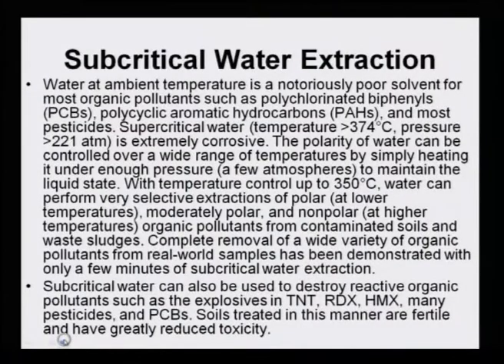Another type of extraction, where subcritical water extraction is used, is also a newer technique compared to the ones I have just mentioned. Water at ambient temperature is a notoriously poor solvent for most organic pollutants such as polychlorinated biphenyls, polycyclic aromatic hydrocarbons and most of the other pesticides.